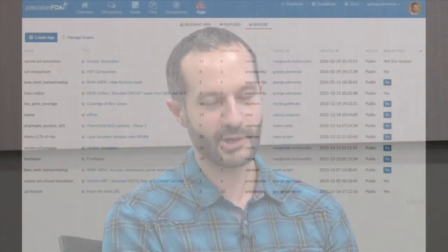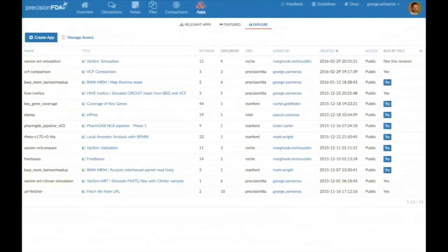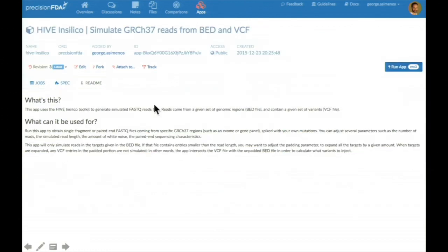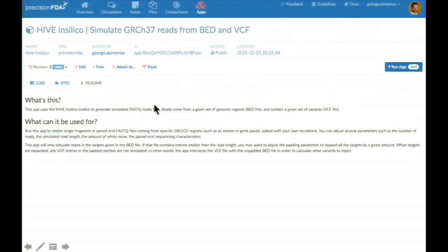There's also the ability to run software pipelines or apps that can do pretty much anything so long as they run on Linux. As an example, you'll see here a few of the pipelines that have been contributed by the community including simulation tools that can be used to evaluate software pipelines by creating a simulated dataset. When someone runs one of these pipelines, they are presented with a screen where they need to enter input parameters. For example, this simulation creates reads from a VCF file and a BED file.